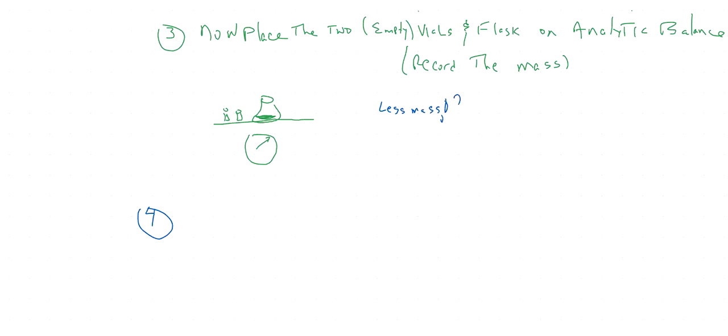Why? Well, you'll see bubbles, and those bubbles are going to be carbon dioxide escaping. Okay, the carbon dioxide is escaping. All right, and I'll write the reactions when we're done.